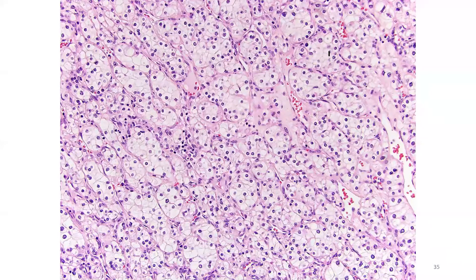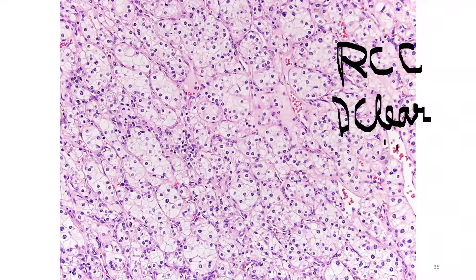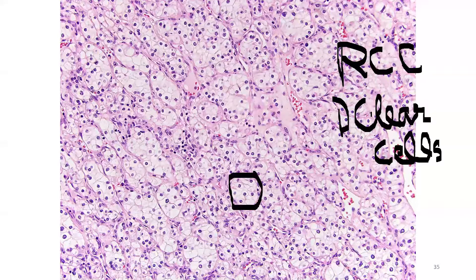This slide shows renal cell carcinoma. There are various types of RCC, and this type is the clear cell variant of renal cell carcinoma — the most common type.